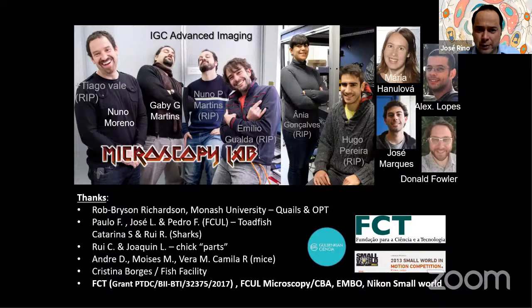Thank you for the talk, Gabi, it was great. Is there any reason why specifically GFP fluorescence doesn't survive many of the clearing protocols? This is from Lino Morgado.